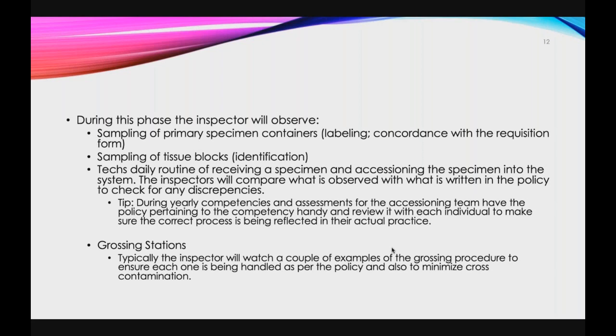Some areas I've been in have their frozen section cryostats in a suite, in the surgical suite, completely away from the grossing room. So it just all depends on your own lab format. But that's something we did that we find very useful. We haven't, luckily, knock on wood, had any concerns over contamination issues, and it really seemed to minimize even near misses.